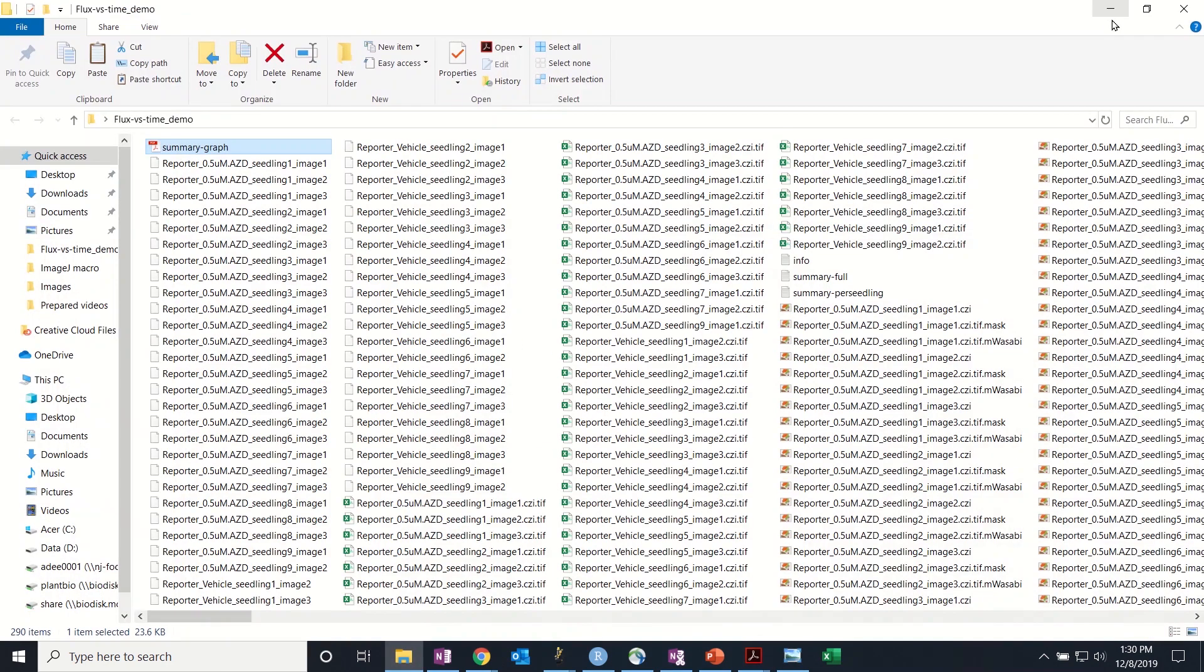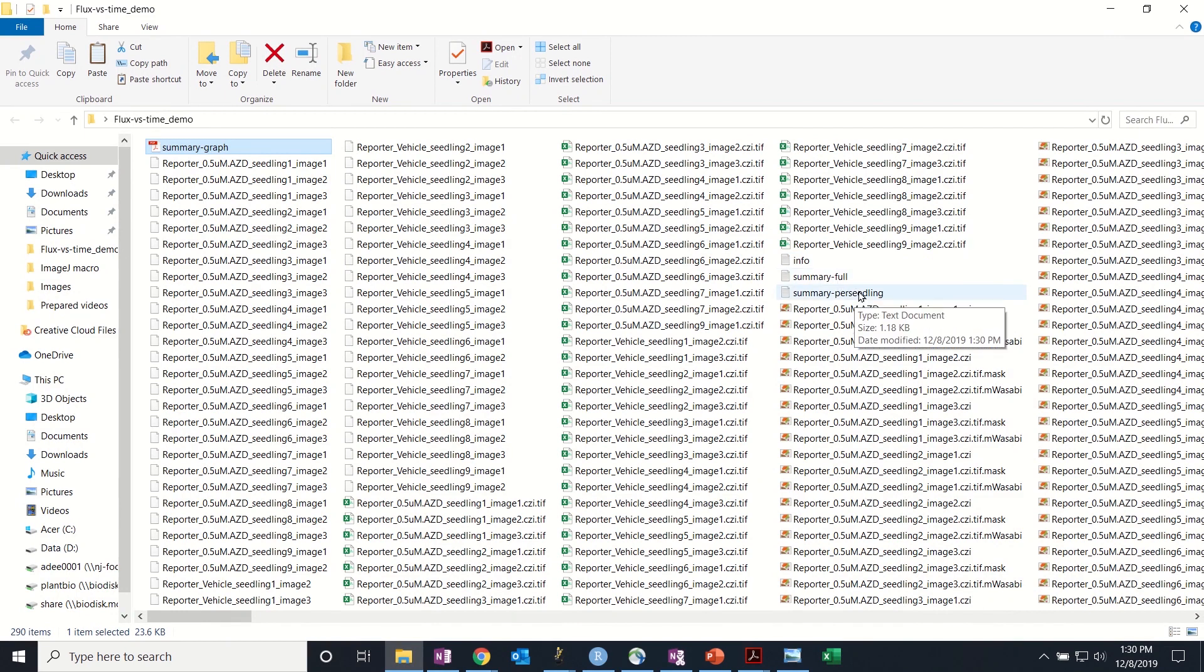Within the file you'll also see there's now a full summary of the data and a summary broken down per seedling.